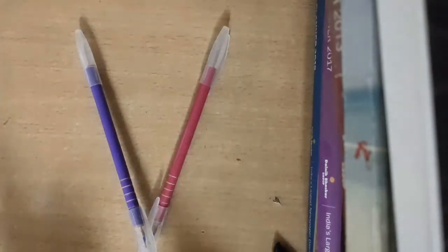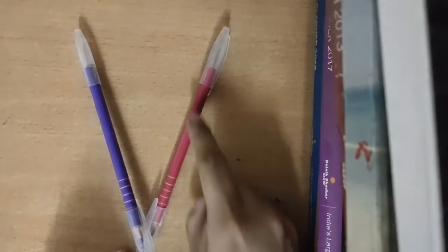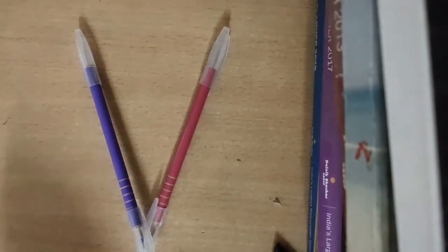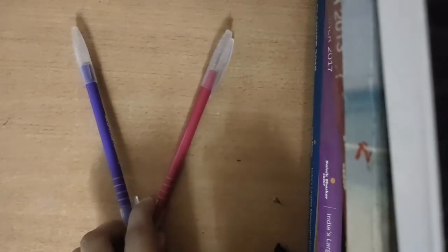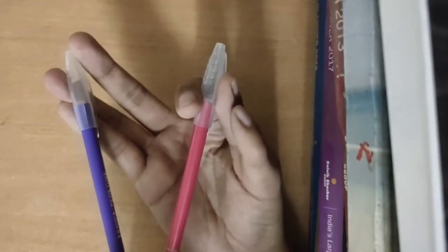Consider this as your complete molecule, these pen caps as the atoms, and these as the bonds between the atoms. So, stretching vibration is of two types: symmetric stretching and asymmetric stretching. In symmetric stretching, the direction of motion will be the same.